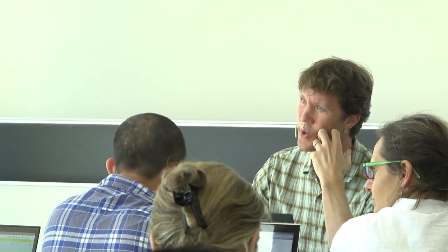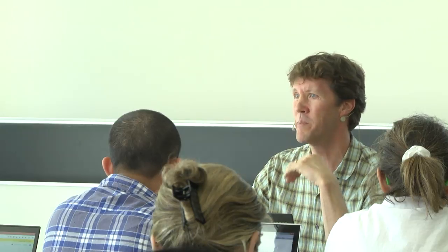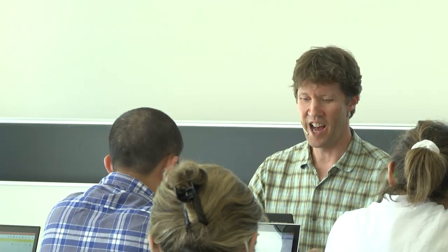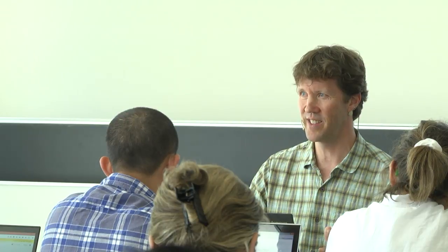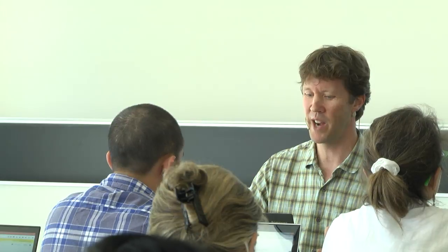Yeah, well, it's much less if you have... Do you have labeled synthetics? Yeah. So then it should be much less. So this is for a label-free experiment. With labeled synthetics, in the data sets that I see, you can certainly do more things to check ratios between your lights and heavies, and Skyline will just pick way better.